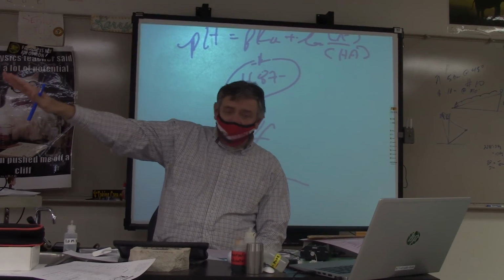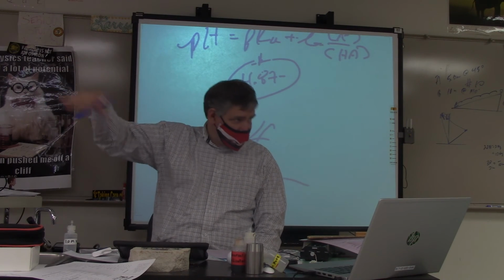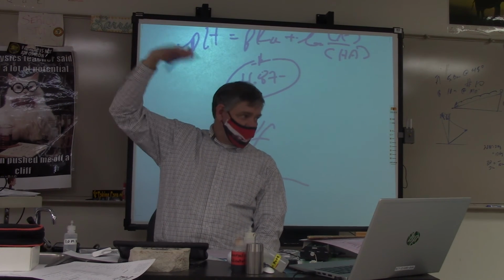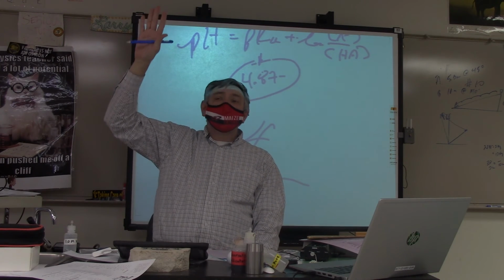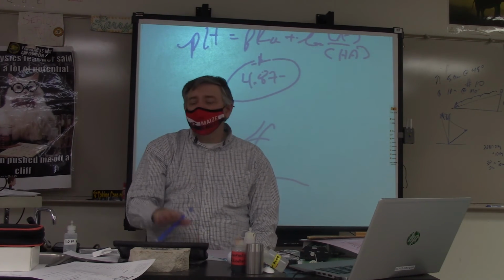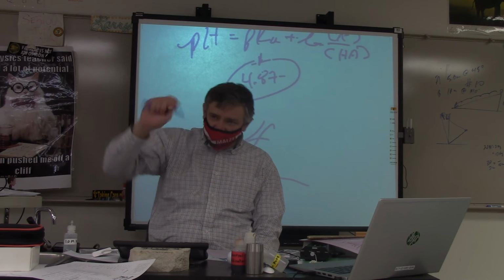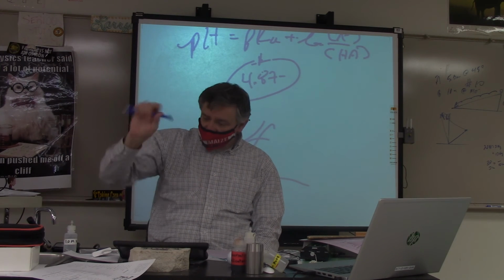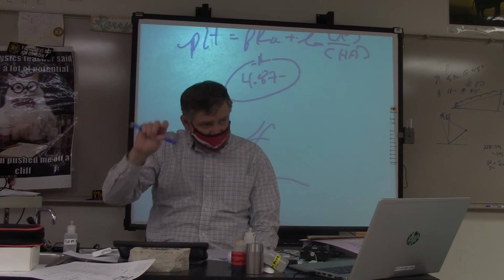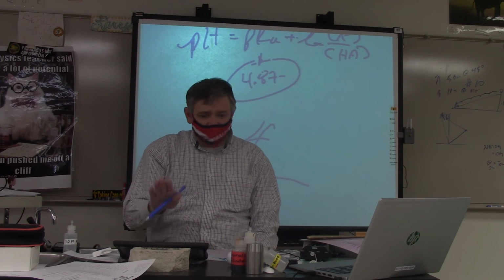You should have already some sodium hydroxide in the burette, but you might have to fill it up to 50 to start. Okay, so you might have to do that. When you get done, thoroughly rinse out those burettes, especially to run water through that valve mechanism at the bottom, okay? So that I don't have any sodium hydroxide left in there gunking up the system. And then put the burettes back up there, wash everything, and we're done.